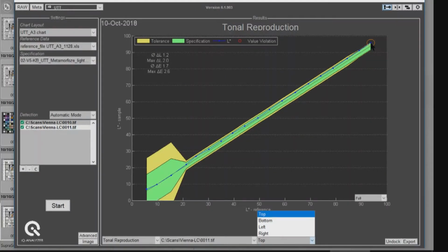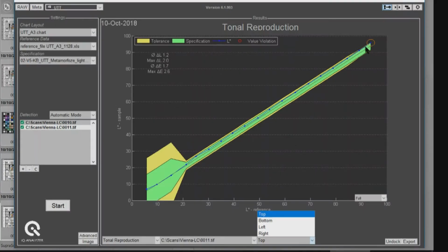And you can see that the four grayscales are about the same. So here there is no trouble to lower the light level. What I have to do, you can see it's a whole curve which is too high. So it will be just dropping it a little bit, just by lowering the light level. If you want to know how much, here you can see it's close to the limit, so it should be 2L, that is 5 RGB levels.